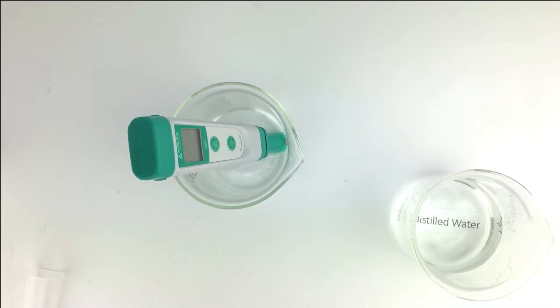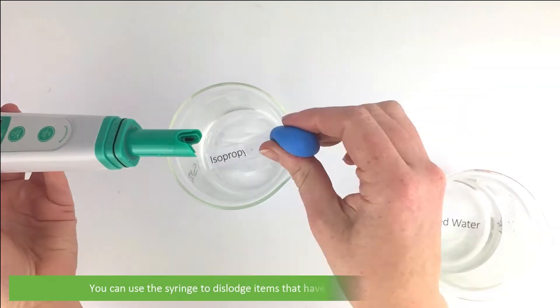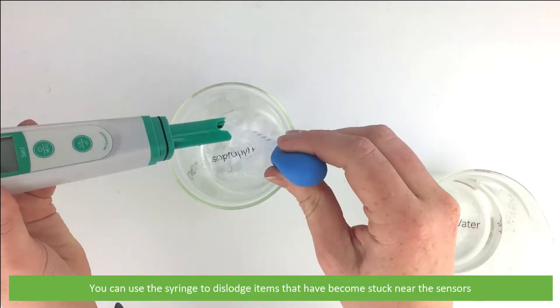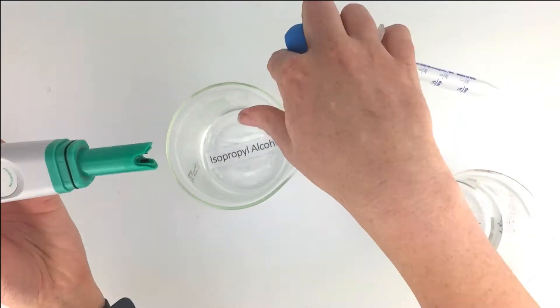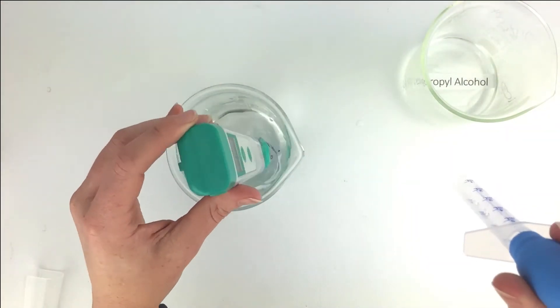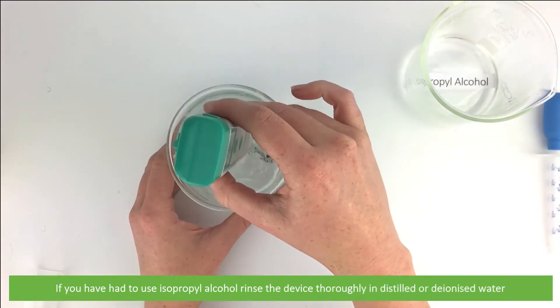Note: just check your manufacturer's instructions for particulars on cleaning. You can use a syringe to dislodge items that have become stuck near the sensors. If you have had to clean using isopropyl alcohol, rinse the device thoroughly in distilled water.